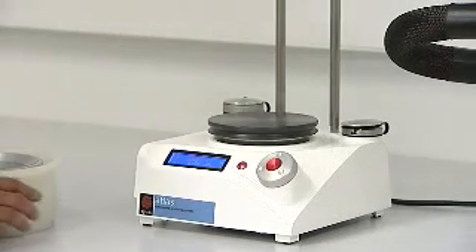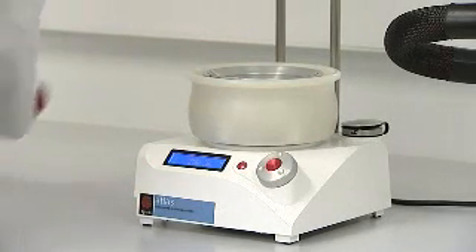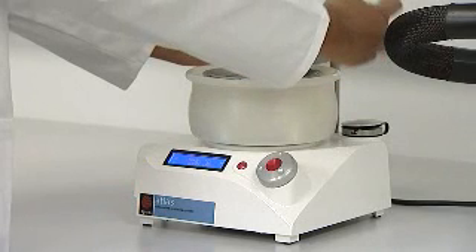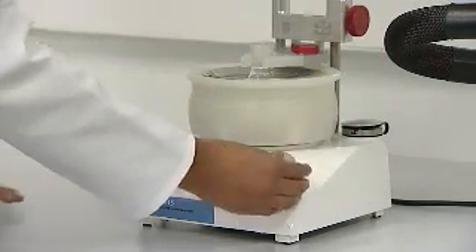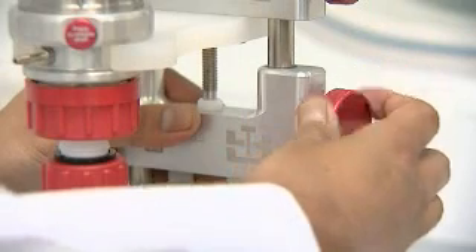The Atlas lithium and sodium systems automate reactions in round-bottom flasks. The Atlas hot plate and stacking dry bath rapidly heat round-bottom flasks from 50 ml to 1 liter, yet the exterior surface remains safe to touch. The clamp automatically aligns a range of flasks to the dry bath. Turning the control knob changes the hot plate temperature and the magnetic stirrer speed.